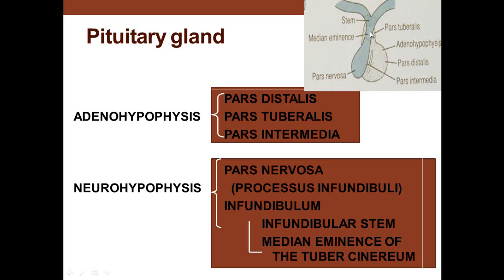Also, there's a neurohypophysis, which is a pars nervosa that we see there, infundibulum stalk, and the median eminence. All this blue here is part of the neurohypophysis, and that's actually nerves. So this comes from the ectoderm, whenever the pituitary was developed, from the oral cavity here or from the brain in the case of this. And these neurons are up here, and they send their projection down here, as we'll learn.